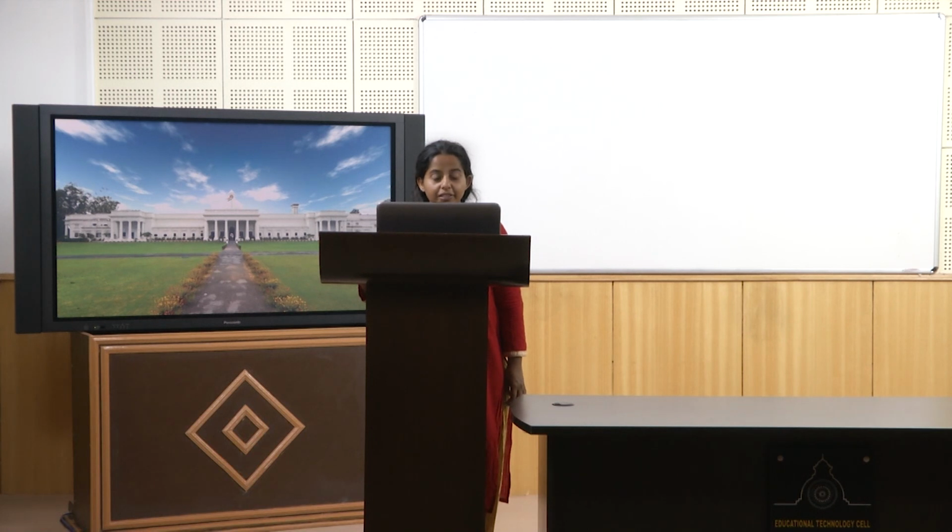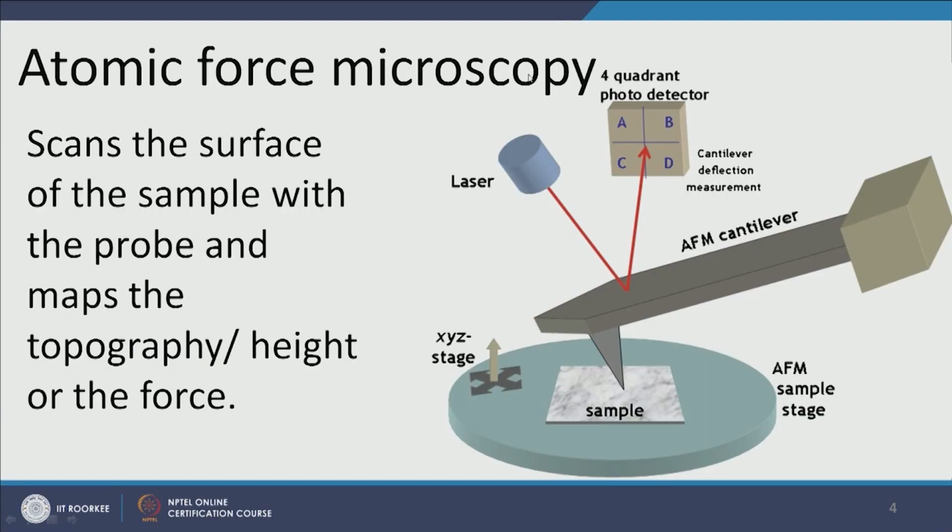The other kind of microscopy that's very popular nowadays in microbial research communities is atomic force microscopy. Atomic force microscopy is a beautiful instrument whose inventors actually won a Nobel Prize for it, where we have a cantilever that holds a very small sharp pointed needle. On its edge it is nanoscale, and we have the sample laid on a very stable and leveled stage, and this cantilever is moved around the sample while its pointed needle interacts with the sample.